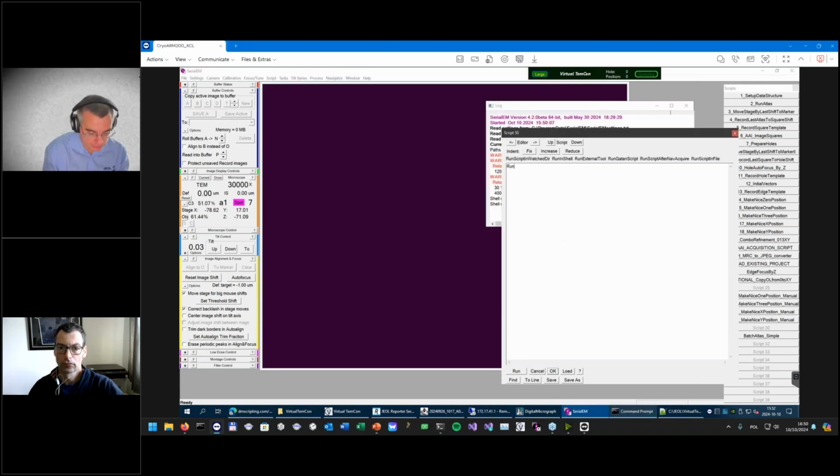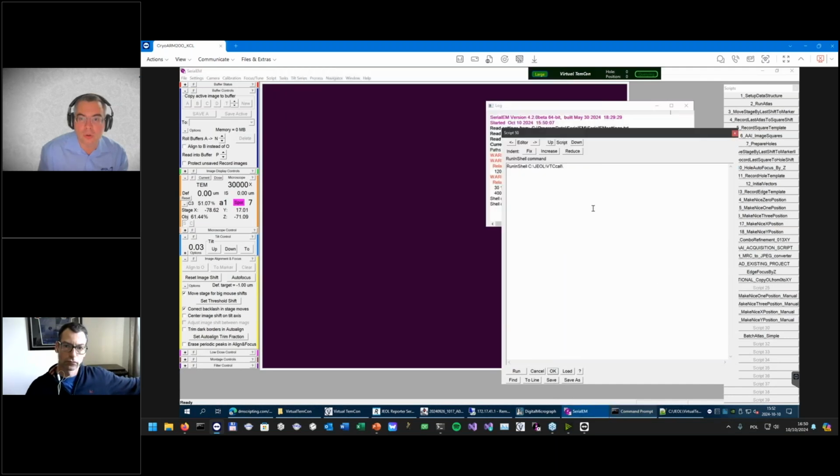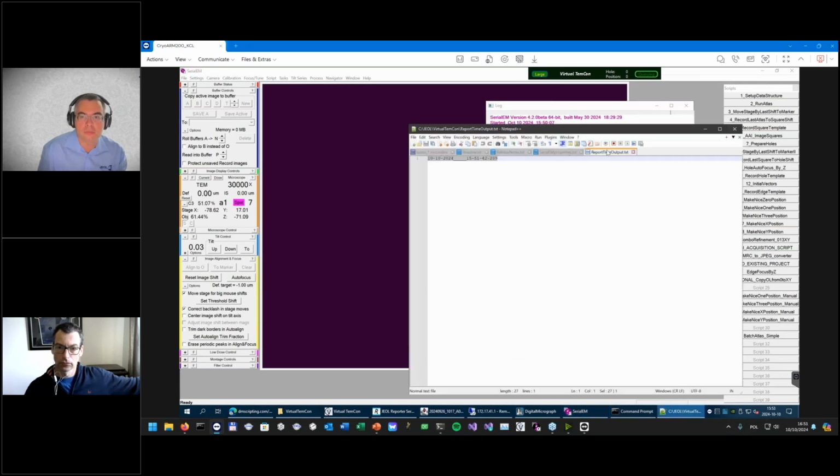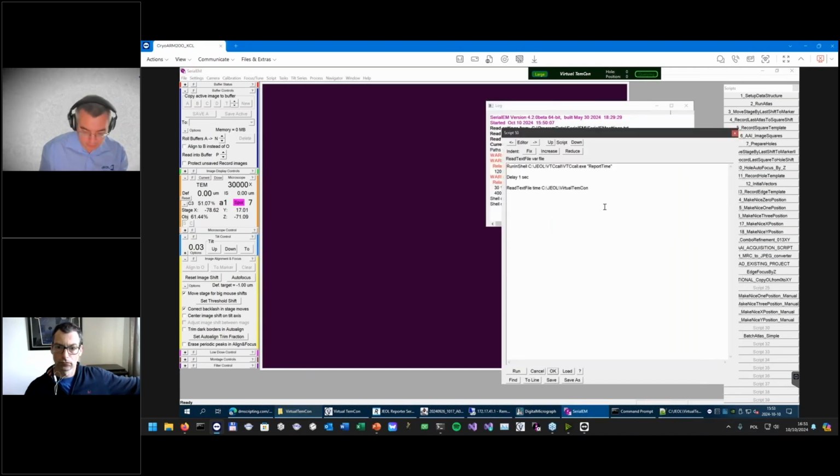So I use runinshell, then I say C:\JEOL\VTC call, and then VTC call report time, and then I maybe give it a delay of, let's say, 1 second so it can process it, and then I can ReadTextFile and create maybe a variable called time, and then this is in this directory, and the file is called report time output.txt, and then I can echo the time now is $time.